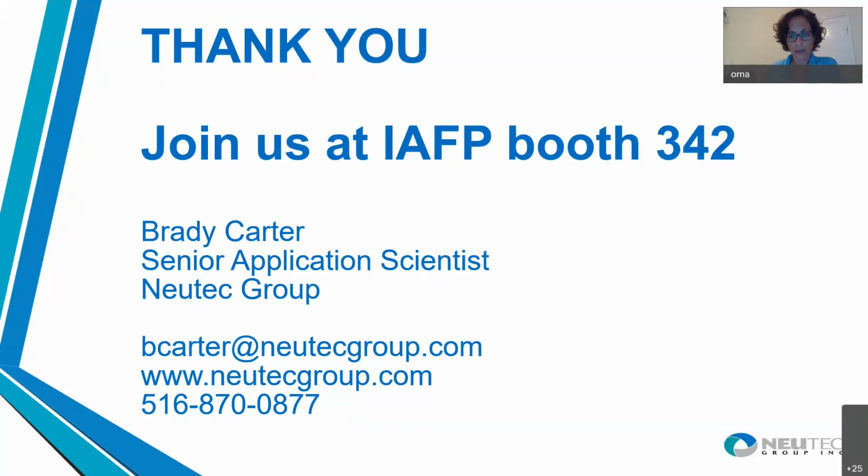So in terms of testing results for things like water activity, the environmental conditions will and can impact the results up until the point when the sample goes into the instrument. When it's in the instrument, it's sealed up against the environment. But certainly prior to that, anytime that the product itself is exposed to the room with no protection through packaging, it's subject to changing to try and match the water activity or the relative humidity of the room.